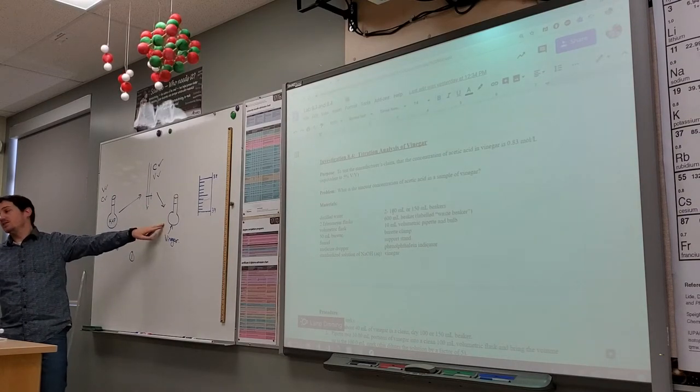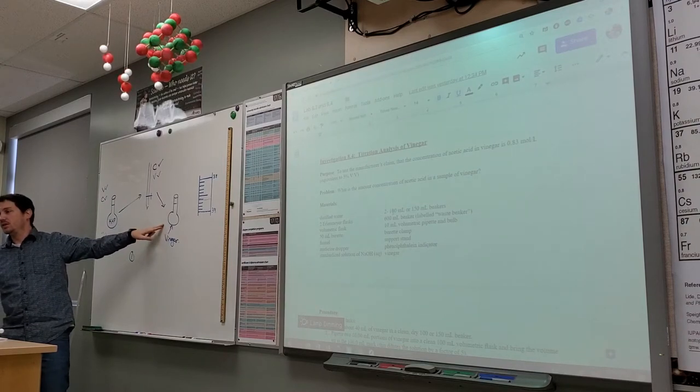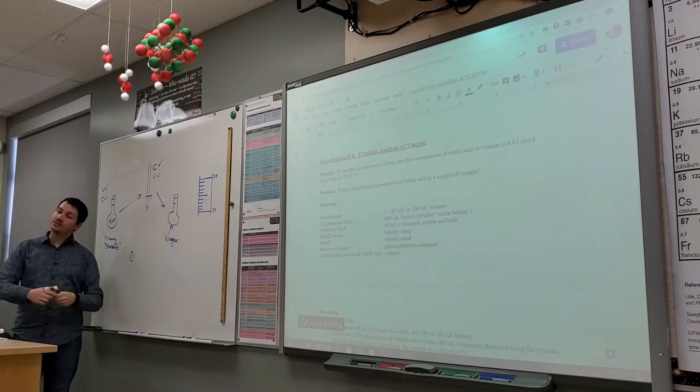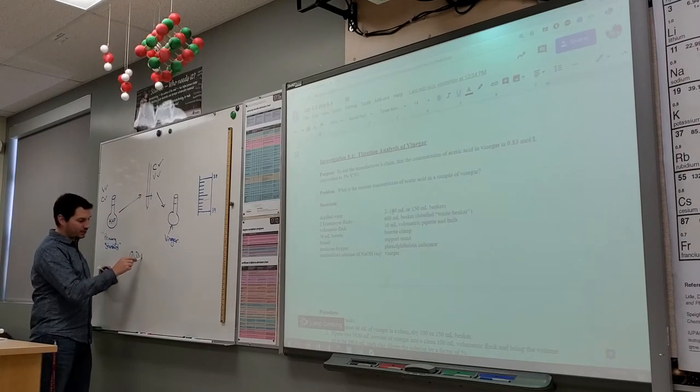If our vinegar is too concentrated, what do we have to do to make it less concentrated? We have to dilute it. So that's the first thing we have to do today - step number one, we're going to dilute.